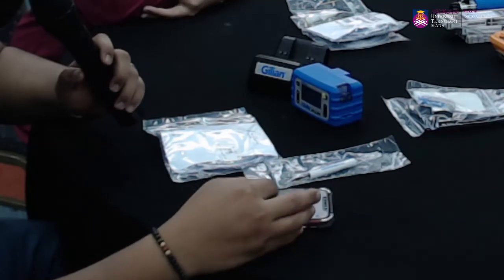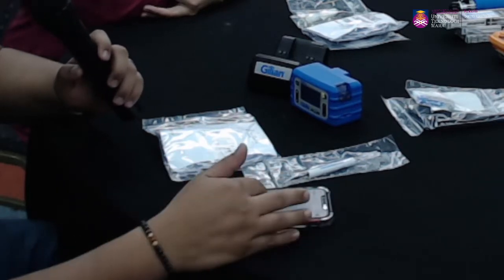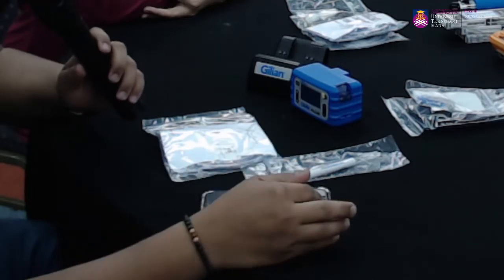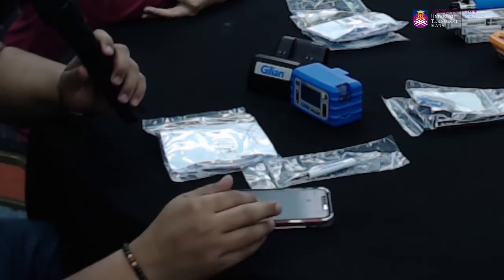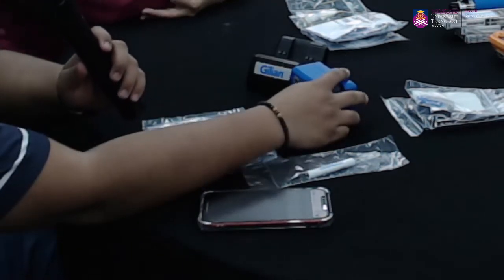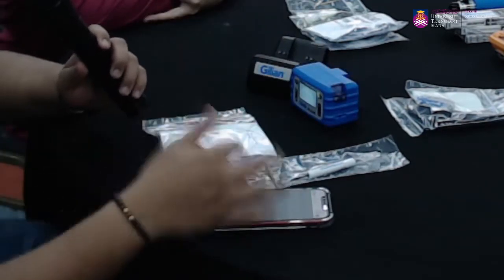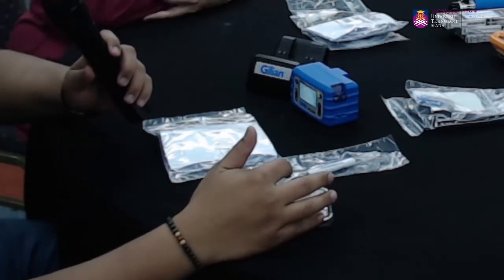Okay, contohnya bila saya setkan, bila saya take settings and support, dari sini kita boleh tukarkan in terms of apa temperature ataupun in terms of berapa unit yang kita nak adjust. Okay, so saya try and select device. Usually ni dia akan refresh kalau contohnya kita run. Nanti dia akan bagi tahu kita current punya measurement berapa, dan reading dia akan keluar pada kita punya application ni.